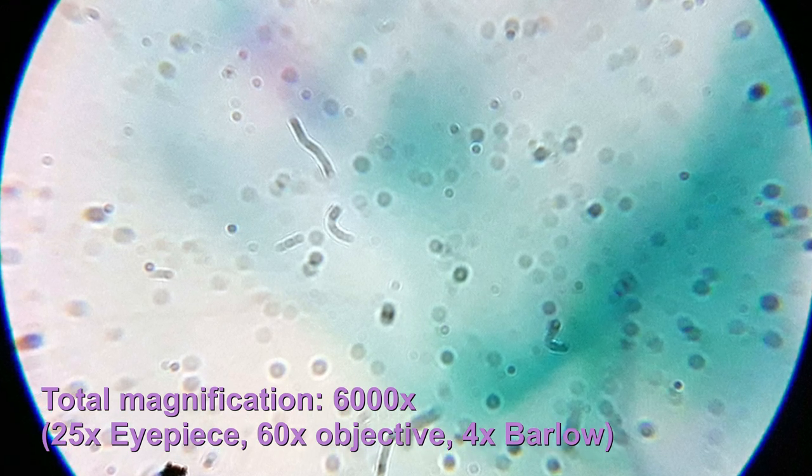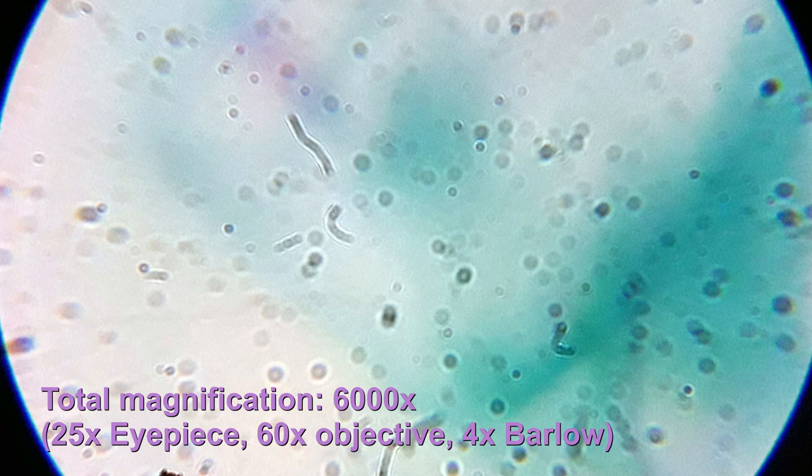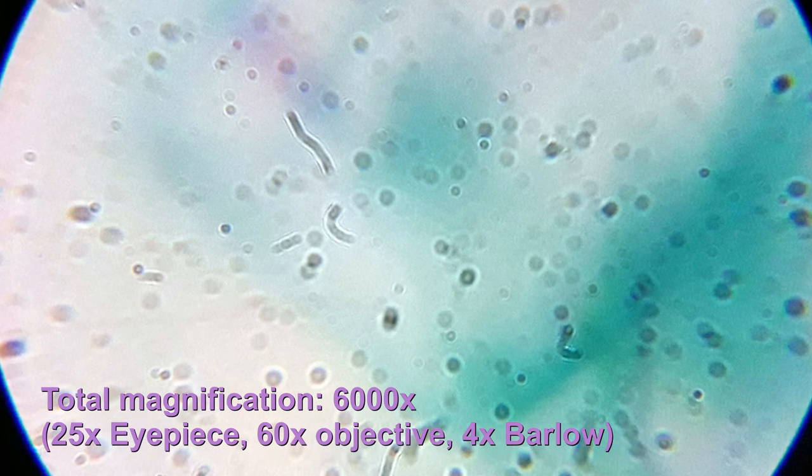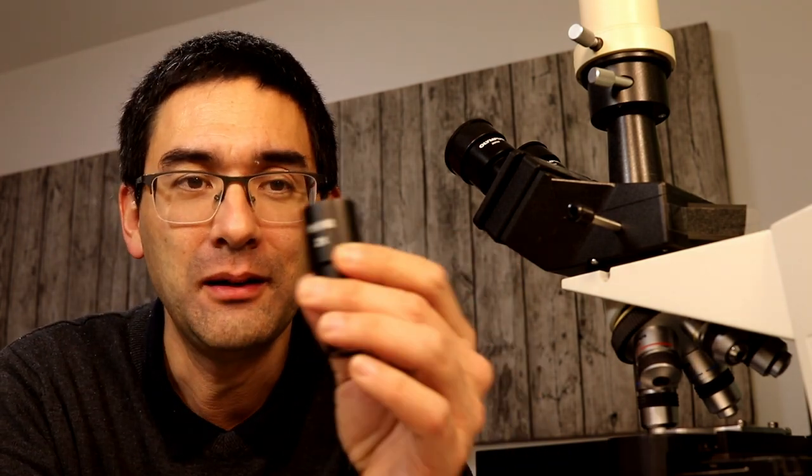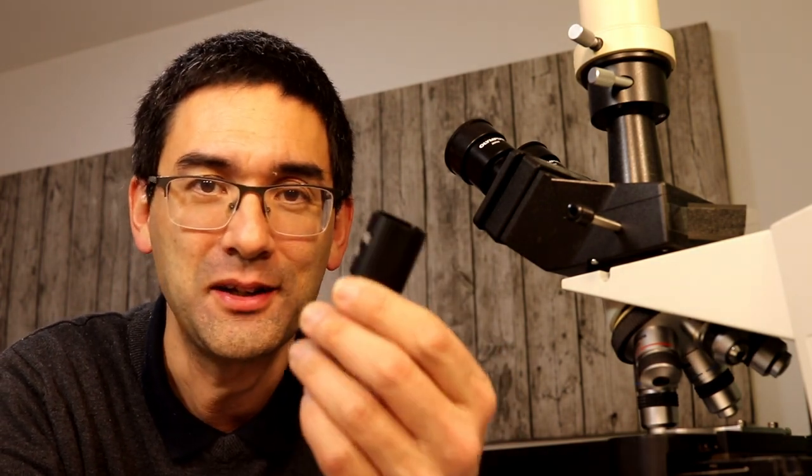That is everything I wanted to show you. What do we learn from all of that? Essentially I just wanted to demonstrate that you can almost get any magnification you want by simply exchanging the eyepiece and adding Barlow lenses. But the problem is you don't always see more because the image becomes darker and also significantly more blurry. My advice is that if you want to increase magnification, first go up with the magnification of the objective.